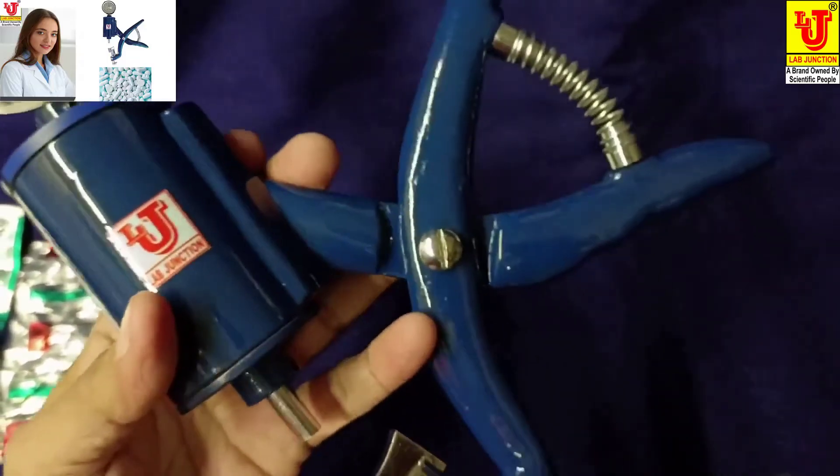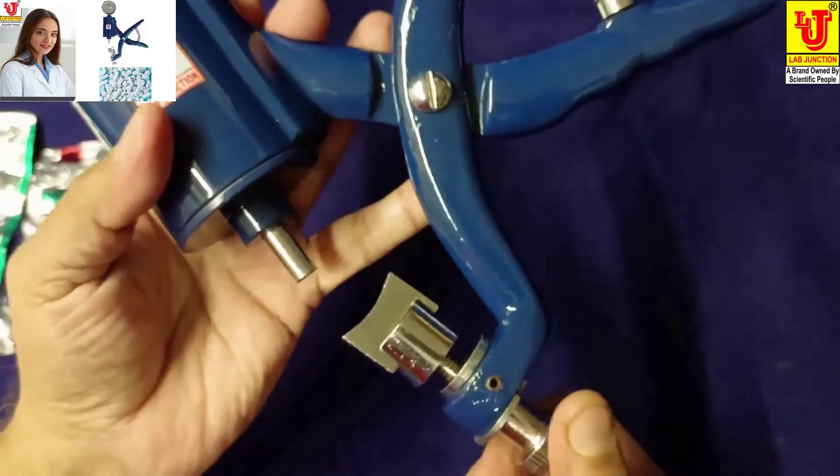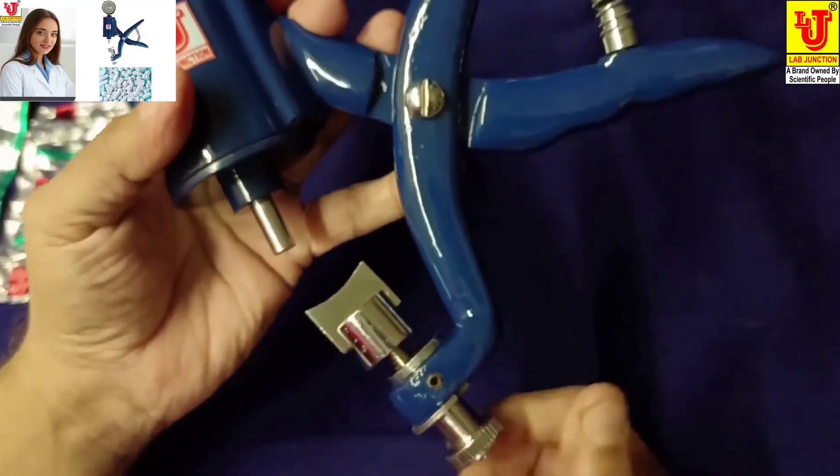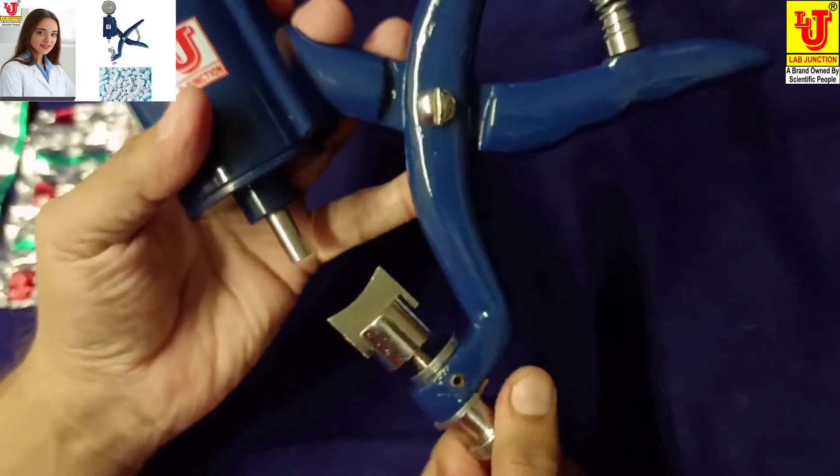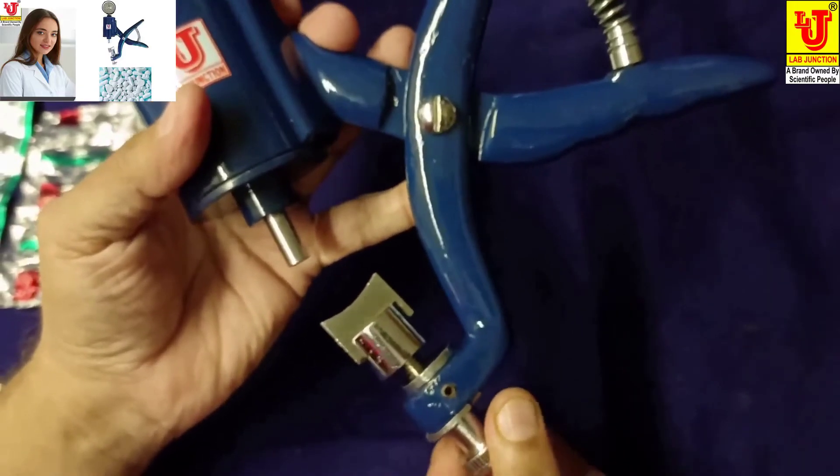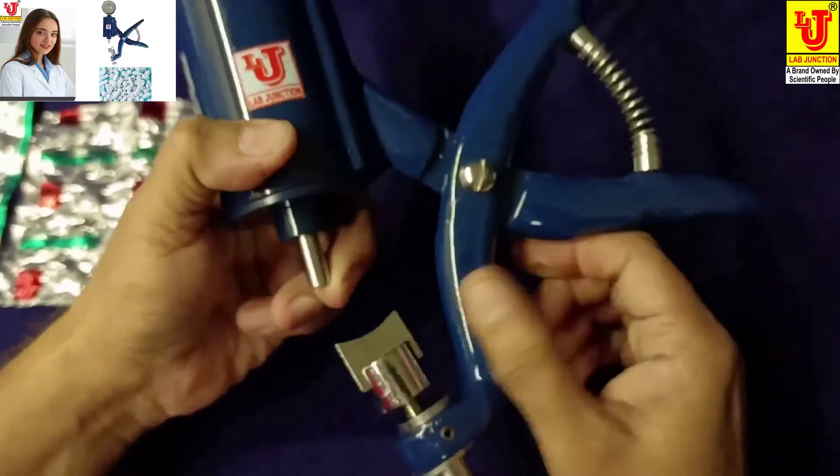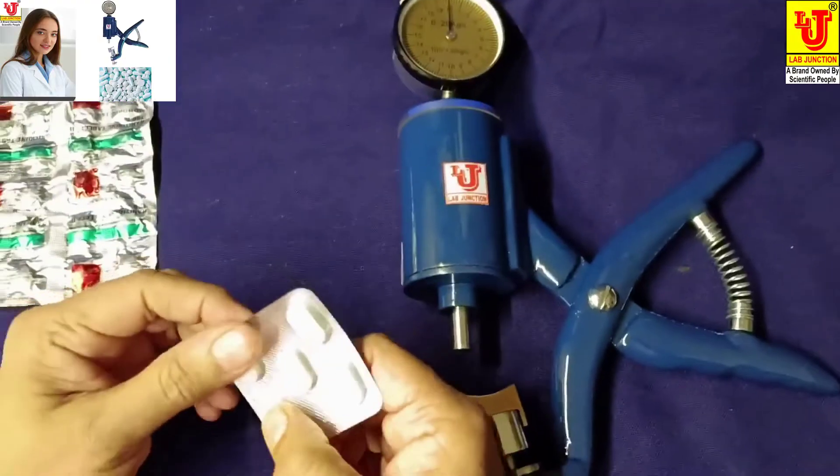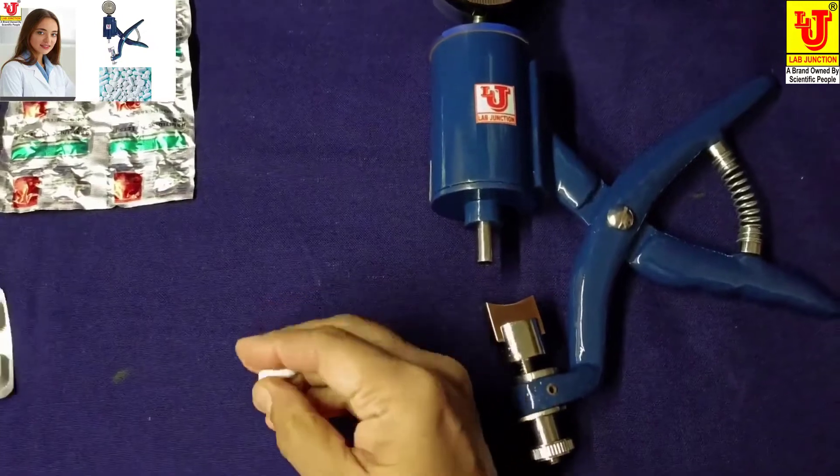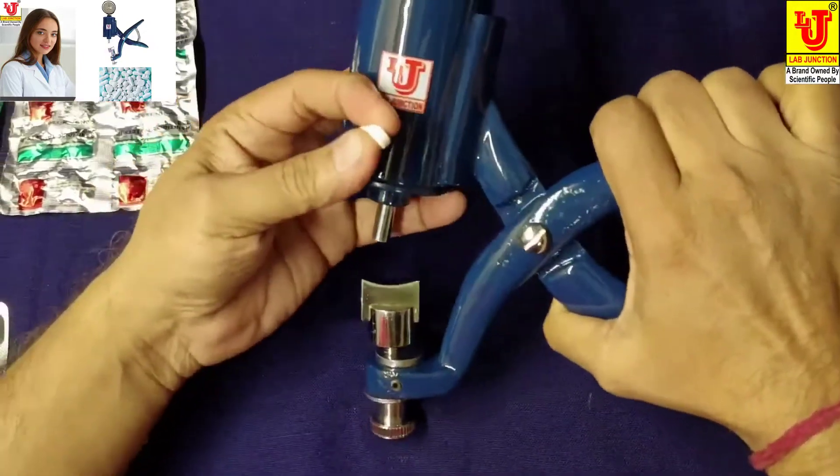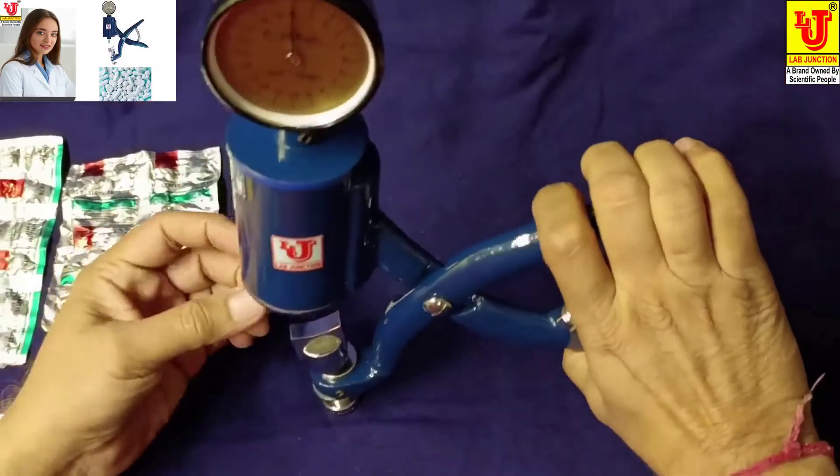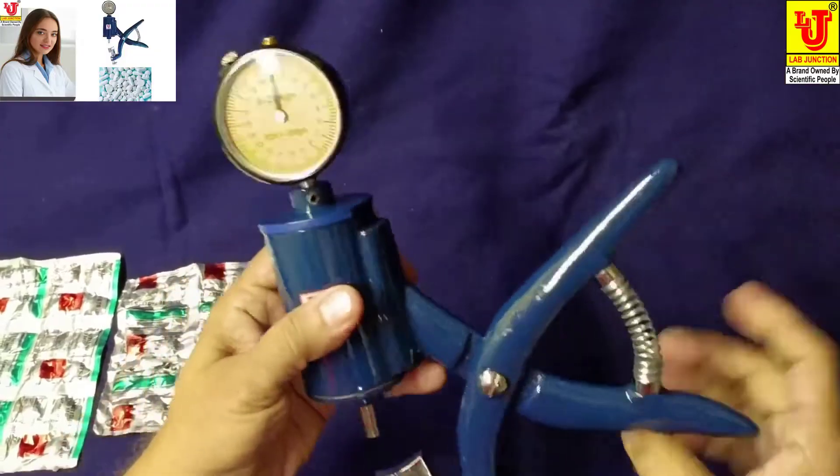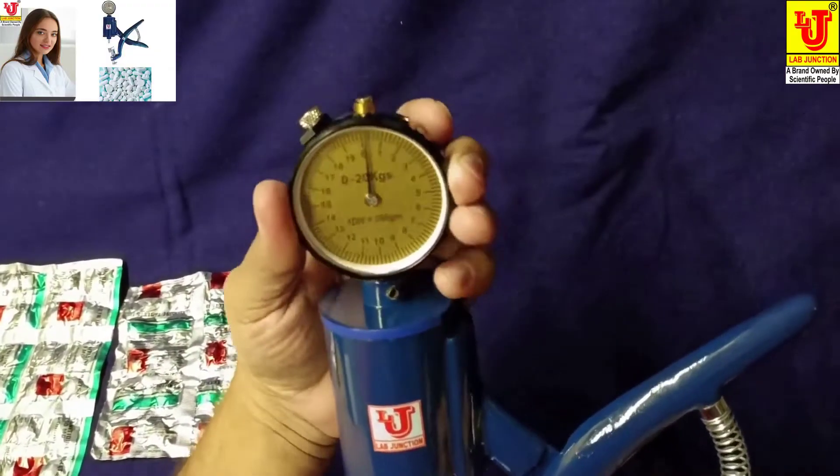This is adjustable for big tablets. If you want to use big tablets, rotate this to scroll down. Then you can adjust big tablets in this gap. I am taking this tablet and placing it here. First, you have to set zero like this.